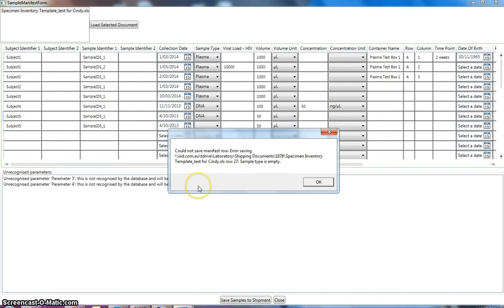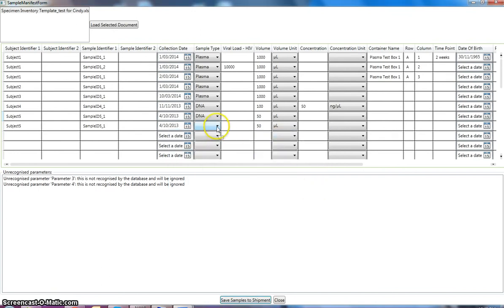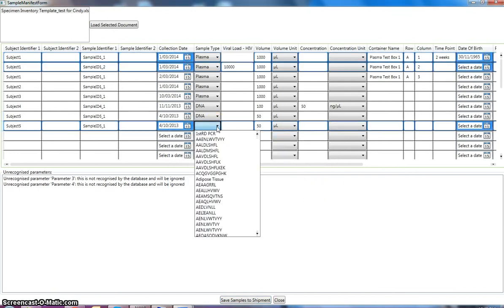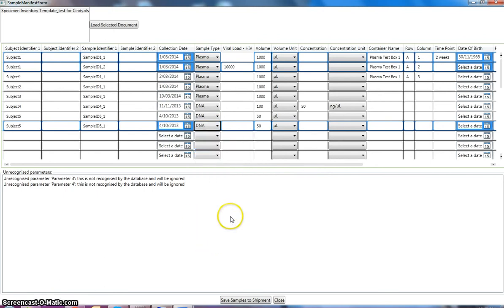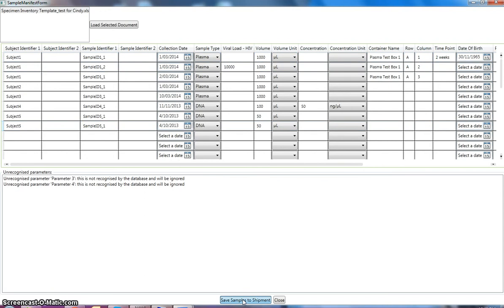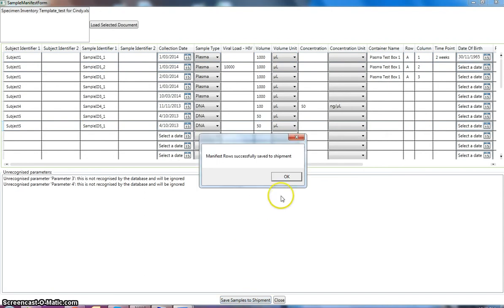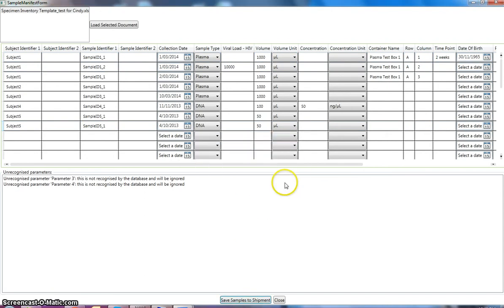By clicking on that button. We're missing a sample type. So we can choose our sample type DNA there. We'll try again. And it tells us that manifest rows have successfully been saved.